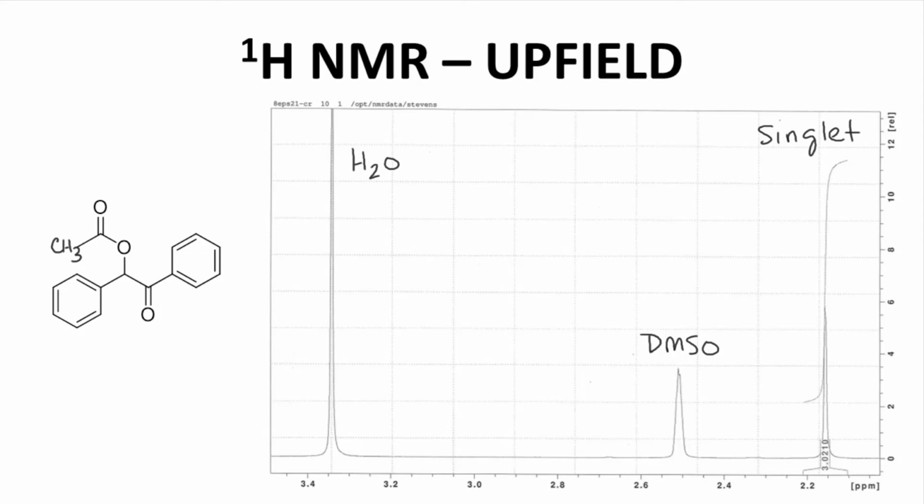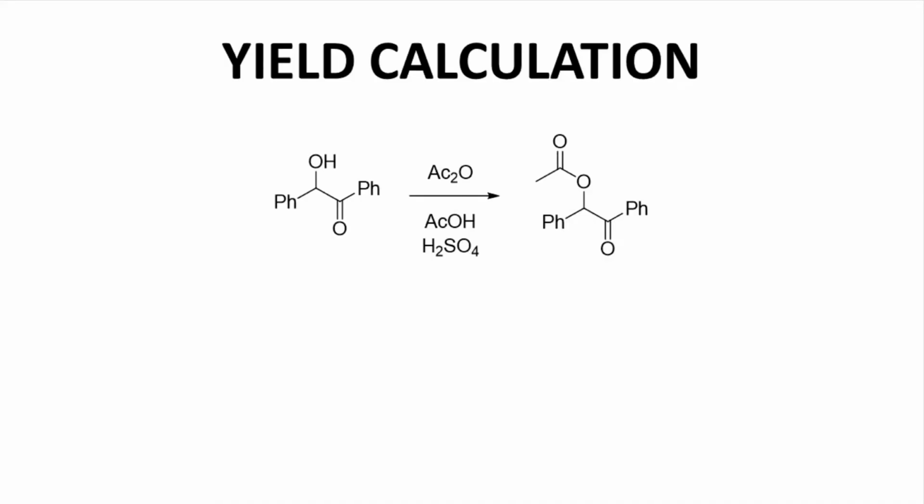Overall, this spectrum looks great. The baseline is pretty clean. Despite being a crude product, this seems to be clean material. All the characterization data look good. Let's finish things up by calculating the yield.